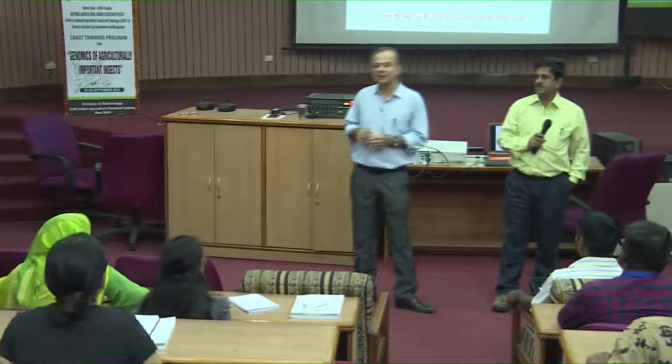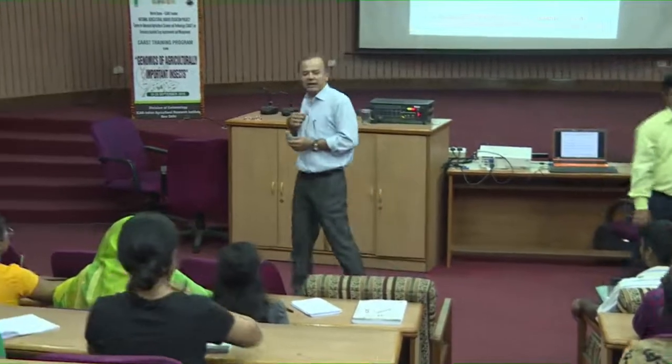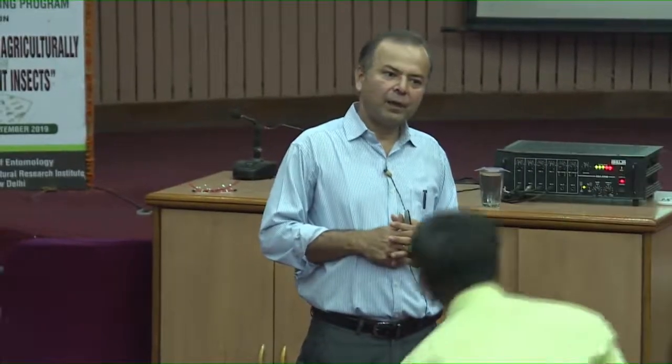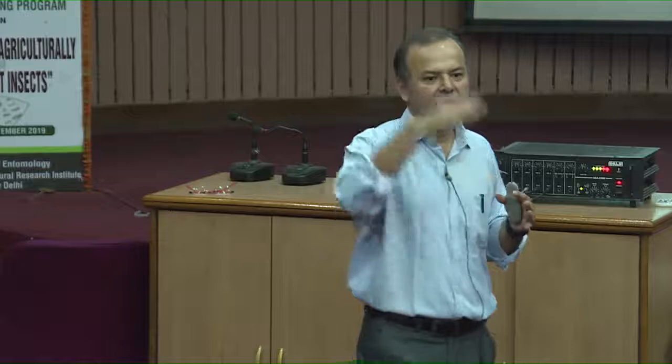Melt curve, okay, significance of melt curve. See, had I known, I could have taken that also. Have you seen how a melt curve looks like? Right? So, what we do in preparing a melt curve: whatever product we have got at the end of, say, qPCR, mostly qPCR, now we try to melt them. How do you melt a DNA strand? Melt means you denature them.